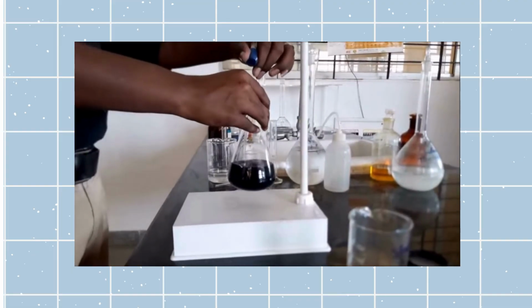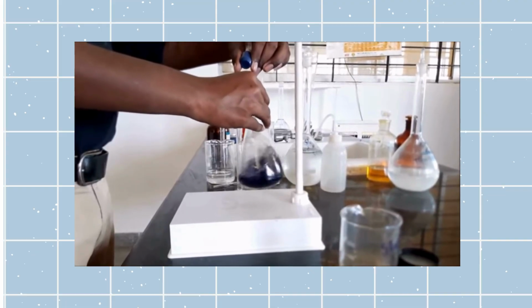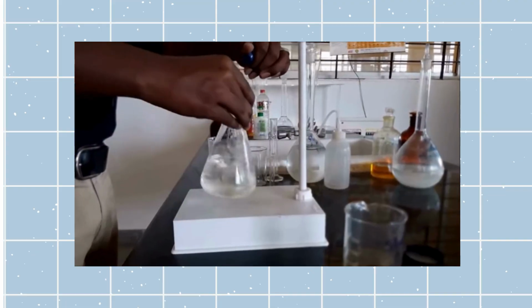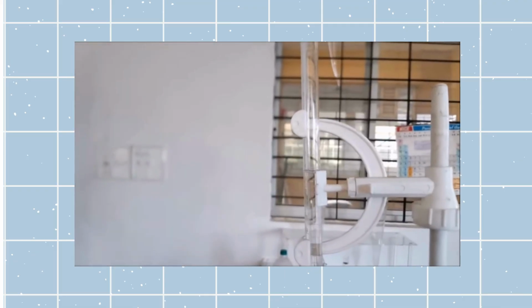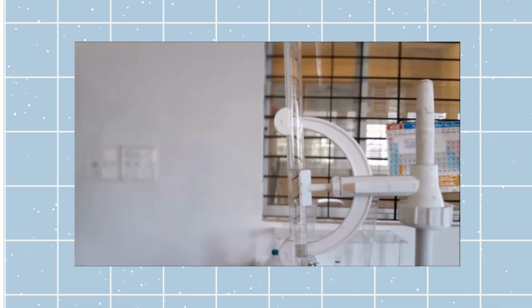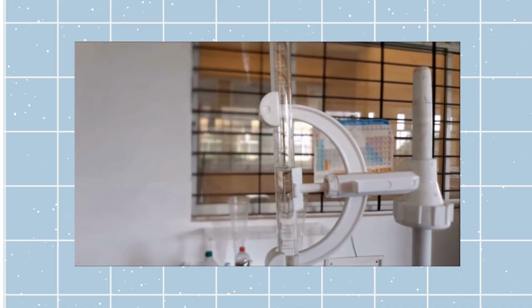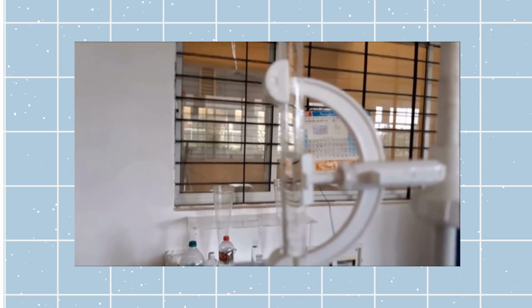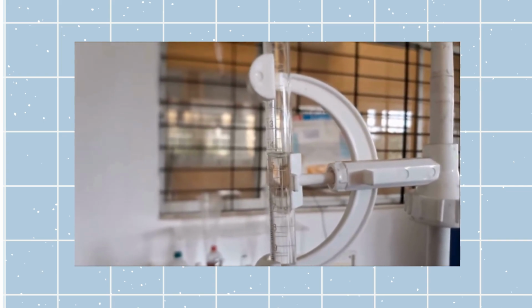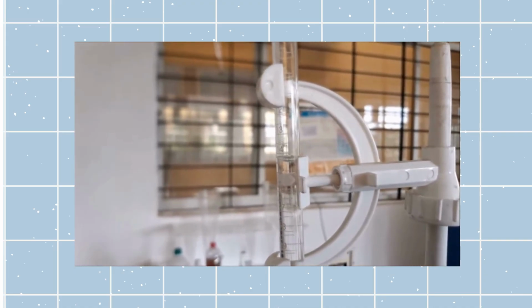Now again, this is being titrated against sodium thiosulfate solution, until the blue color disappears or fades out. Note down the burette reading for the calculation of the amount of residual chlorine present in the sample. Repeat the same procedure for the blank solution. Note down the burette readings for the blank solution, where the blank solution is distilled water. Then deduct the blank reading from the actual sample reading in order to get the residual chlorine value.